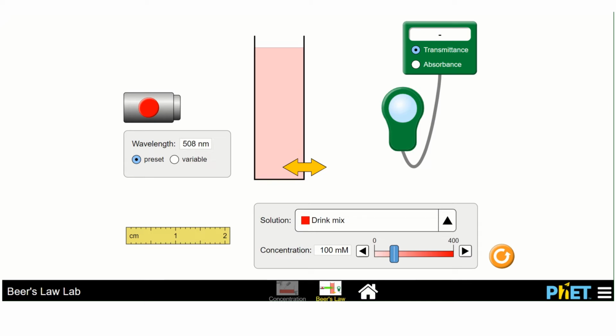So now that I've shown you where everything is and how to adjust everything, I feel that you are prepared. Now, I know you might be looking at the procedure and saying, oh no, how am I going to do all of this? Take it step by step, okay?